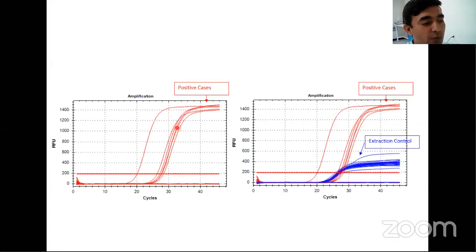Well, here look at the information over here. It is giving us the positive and negative samples. Here from the machine we only selected the FAM dye, so we asked the machine to show us only the FAM color, the positive color, or one channel, and not to show us two or three colors simultaneously. So the machine is not showing us two or three colors at a single time, but only one color. While here in this particular case, the machine is showing us multiple colors.